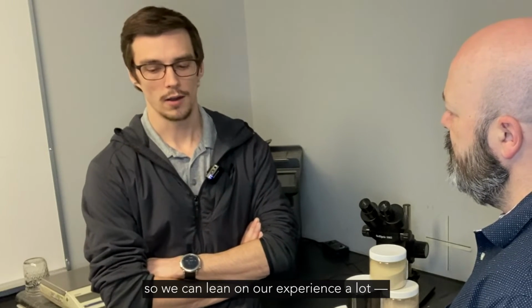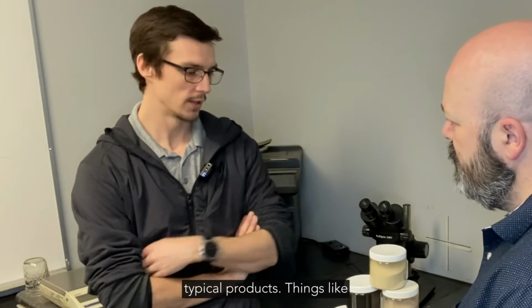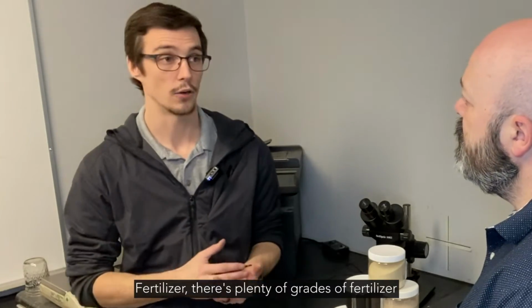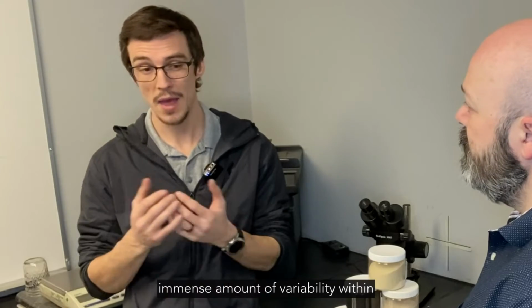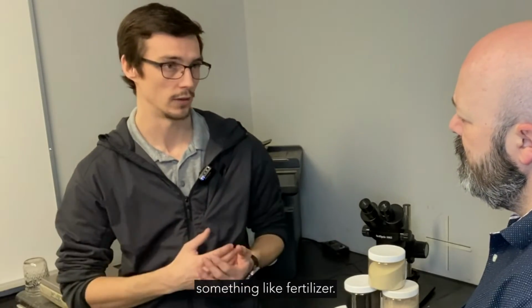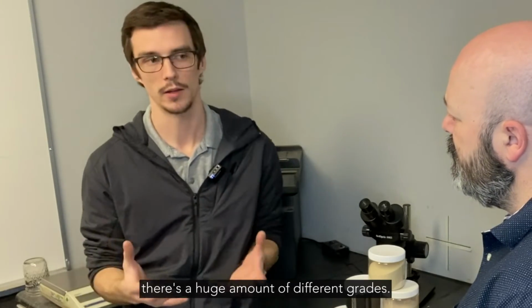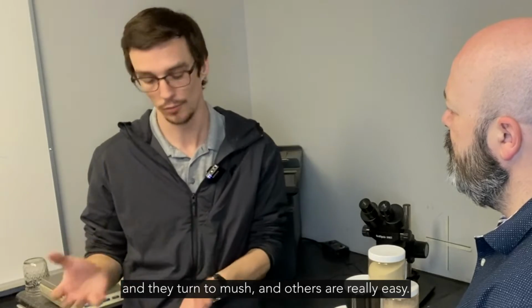So we can lean on our experience a lot of times for more simple applications, typical products, things like sand, it's not a bad one. Fertilizer, there's plenty of grades of fertilizer that we don't need to test again. We've seen a lot of them, but there's an immense amount of variability within something like fertilizer. There's even to just an NPK fertilizer, there's a huge amount of different grades. Some are quite difficult and hygroscopic and they turn to mush, and others are really easy.